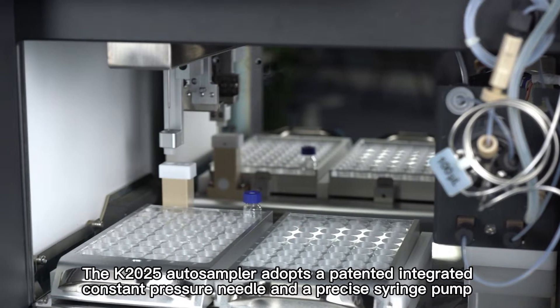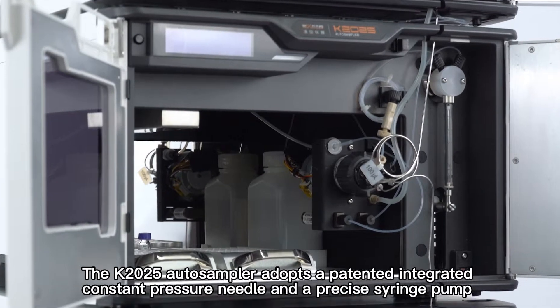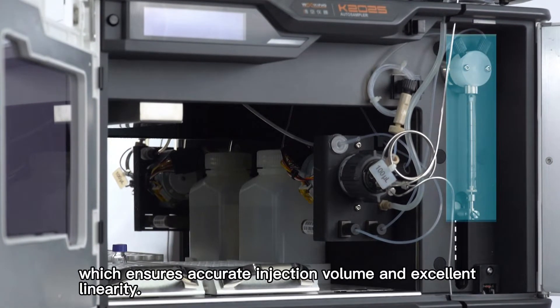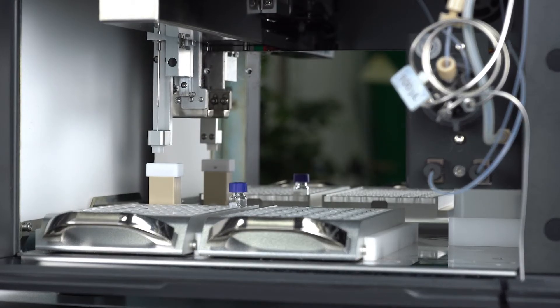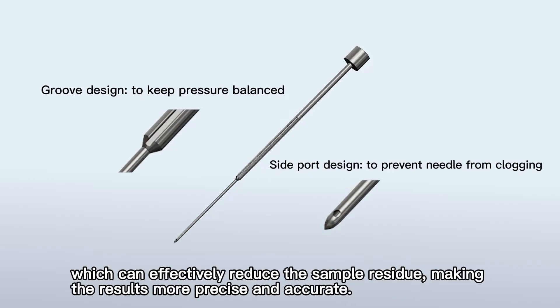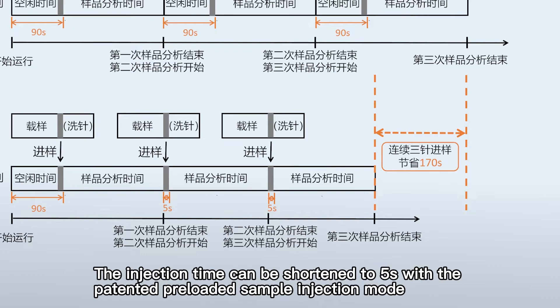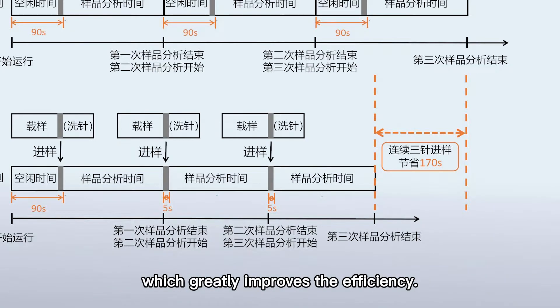The K2025 autosampler adopts a patented integrated constant pressure needle and a precise syringe pump, which ensures accurate injection volume and excellent linearity. The sampling needle is highly polished for the outer surface and passivated for the inner surface, which can effectively reduce sample residue, making the results more precise and accurate. The injection time can be shortened to 5 seconds with the patented preloaded sample injection mode, which greatly improves efficiency.